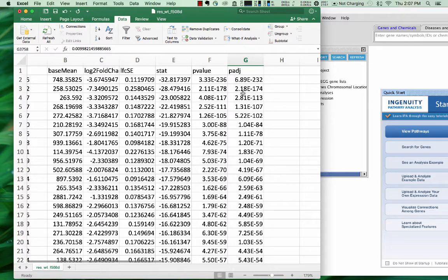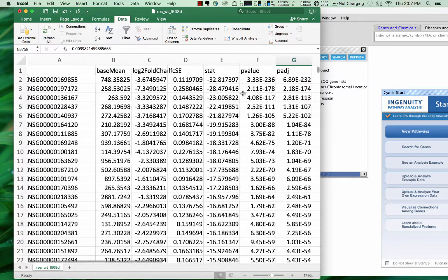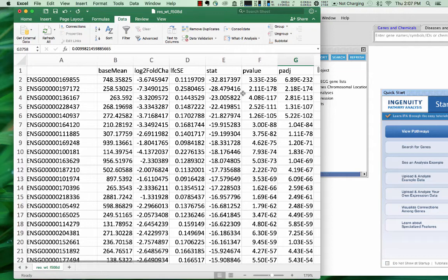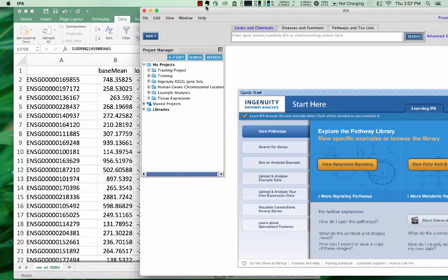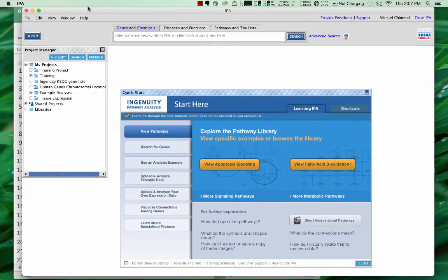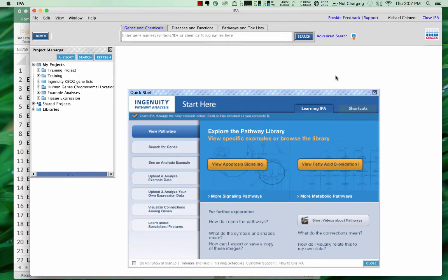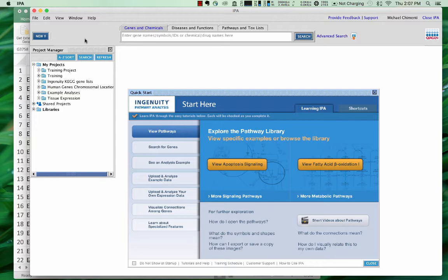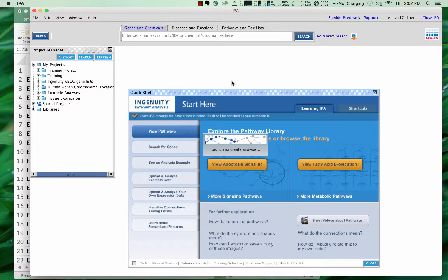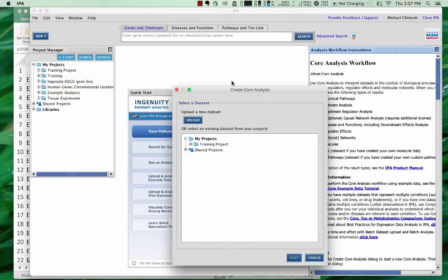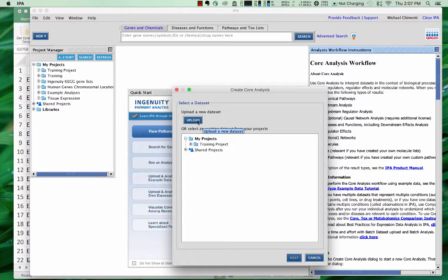So these are the kinds of things that we need to get into IPA in order to do a pathway analysis. So how do you do that? Well, I've got IPA here installed. I'm logged in, so I'm assuming that you've done that already. And the first thing to do is to start a new core analysis. And you want to say upload a new data set.